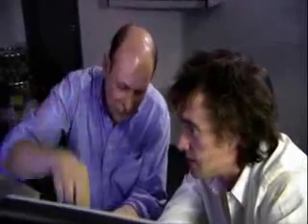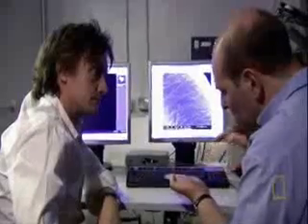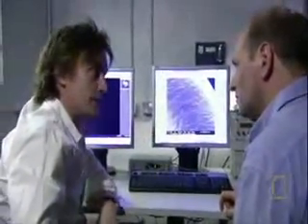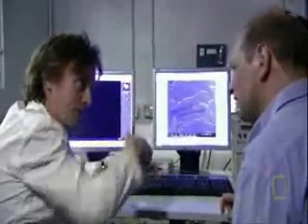Well, here we're coming down vertically onto the surface so that we blast away a pattern on the surface. If we wanted to polish something very smooth, then we'd fire those ions in at a very low angle to the surface so that they just knock away high spots on the surface and leave something that's very, very smooth. So this process that can etch my name lost in the width of a hair, you're saying is heavy duty. And if you want to have some real finesse and polish, you send it in at a more acute angle rather than perpendicular. This is your heavy engineering going. It's heavy engineering, but a very, very small scale, atom by atom.